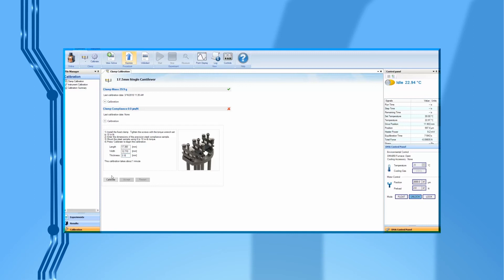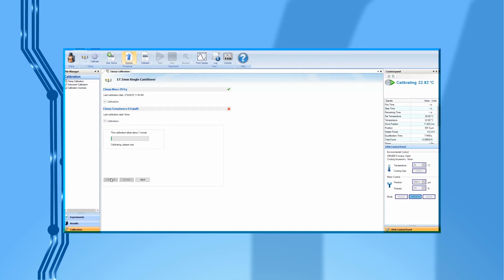Enter the sample dimension to the software. Then, press Calibrate to begin the compliance calibration. This calibration step will take about 1 minute. If the calibration is finished normally, the compliance value should typically be lower than 0.8 micrometer per newton. Click on Accept to finish the calibration.